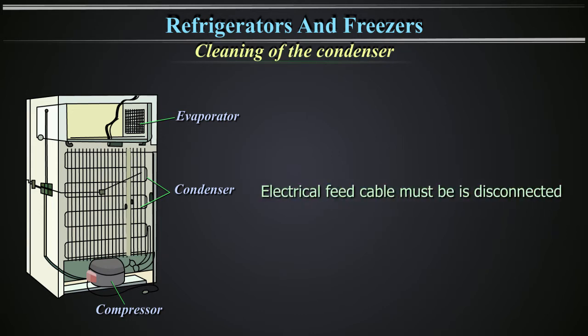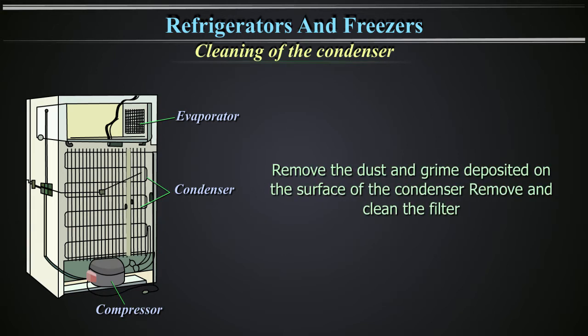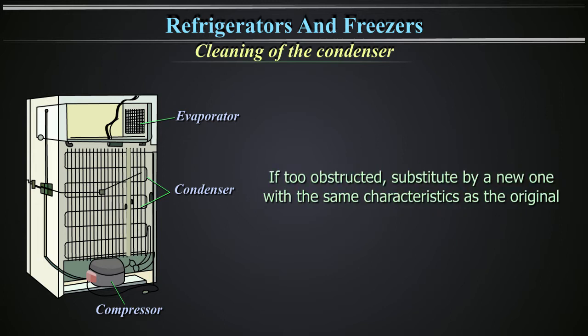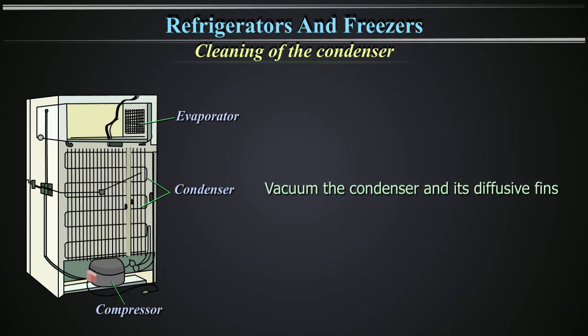For condenser cleaning: disconnect the electrical feed cable and remove the protective grid. Remove the dust and grime deposited on the surface of the condenser. Remove and clean the filter; if too obstructed, substitute it with a new one with the same characteristics as the original. Verify the functioning of the ventilator and vacuum the condenser and its diffusive fins. Reinstall the protective grid and the filter.